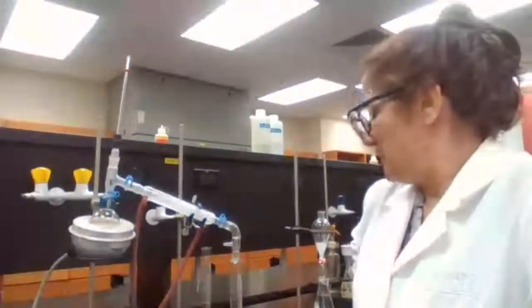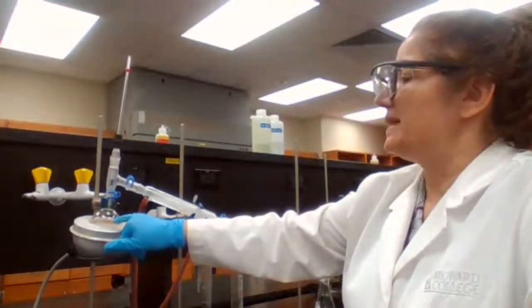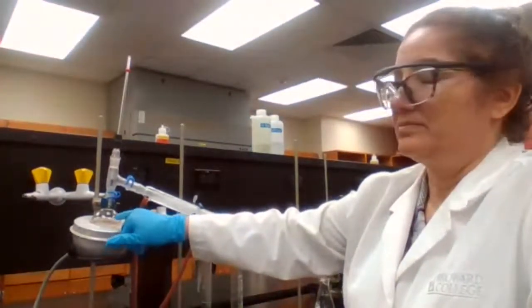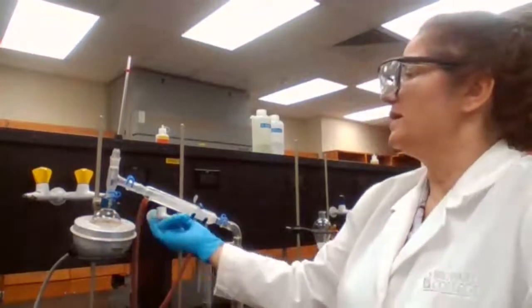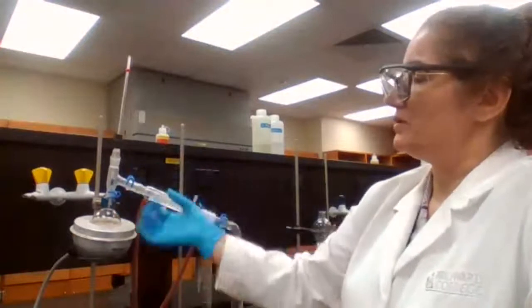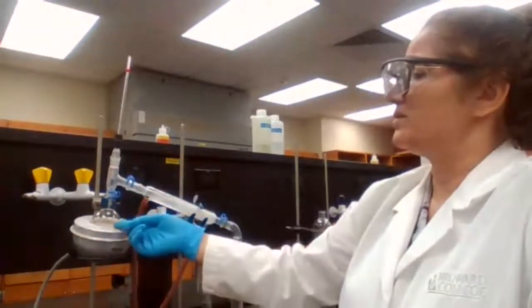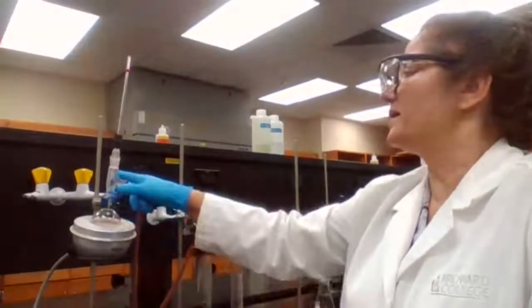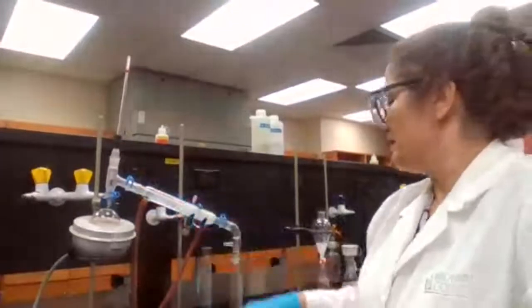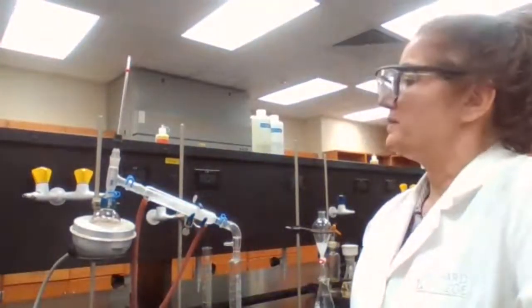What is actually done here is steam distillation, because the aqueous solution that we have, the sodium hydroxide, provides the water, and the water is going to vaporize, and as it's vaporizing, it's taking the drops of oil, droplets, and bringing them up into the condenser. So that's why we are getting a cloudy solution here.